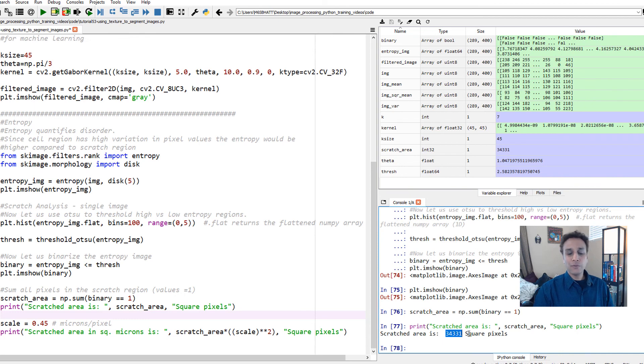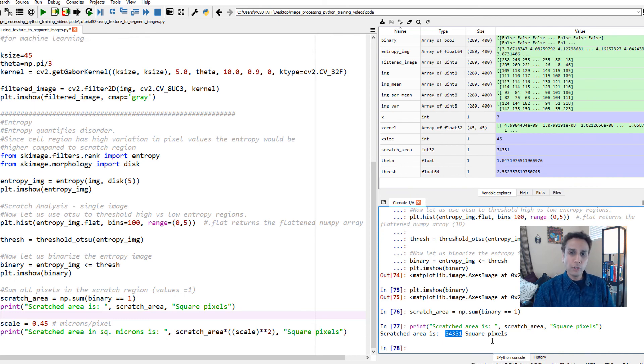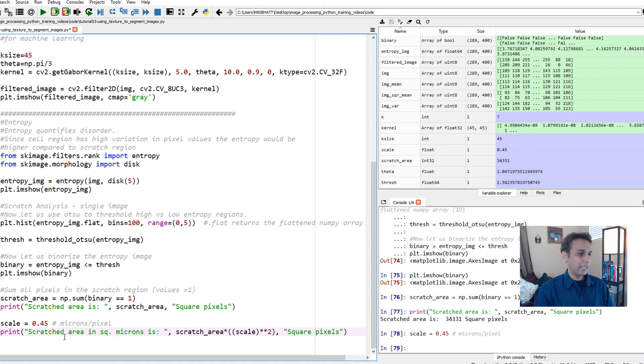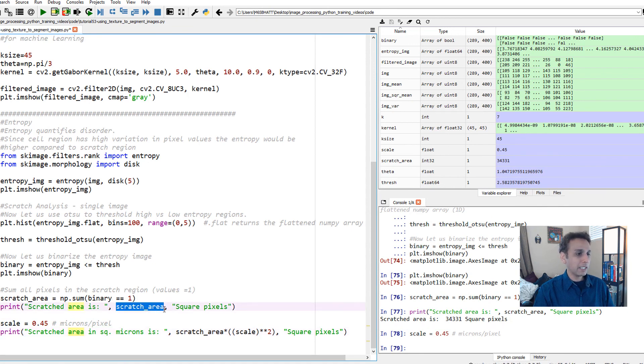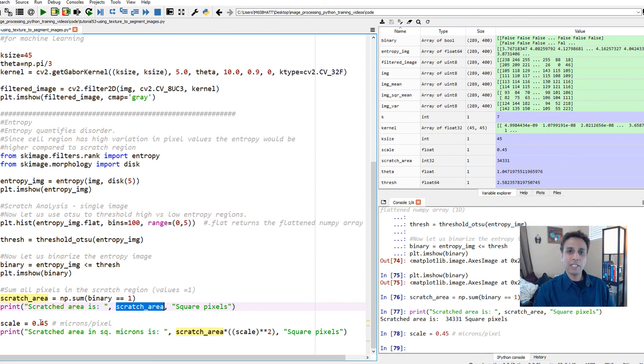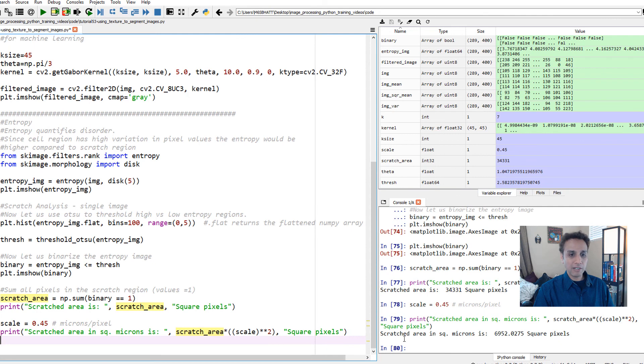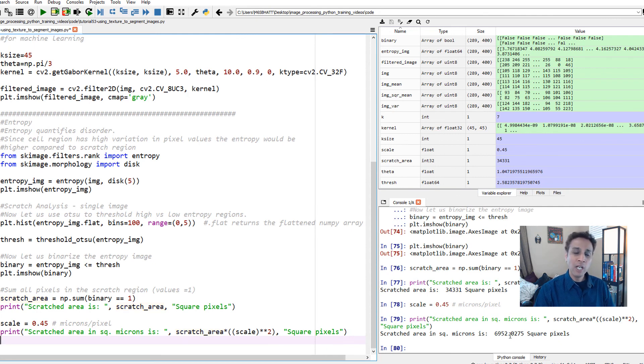If you want to convert that into square microns, you need to know your pixel size. If my pixel size is 0.45 microns per pixel, then my scratched area is the scratch area in pixels multiplied by square of the scale. This is area, so you multiply by square of the scale. My scratched area in square microns is 6,952 square microns.